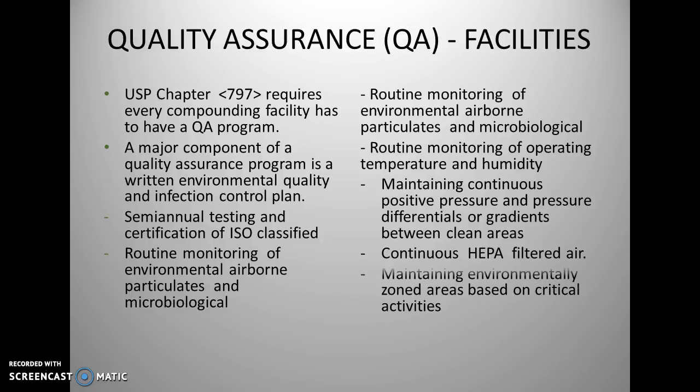Continuous HEPA filtered air, making sure that whenever the filter needs to be changed, it is changed. Retain an environmental zone area based on critical activities. And then, of course, you want to limit the access. So many times, only individuals who are certified to be in that particular area will be in it. It's not a common area where there's a lot of traffic. Many times it is behind locked doors, and there's only ID key access to that particular area.